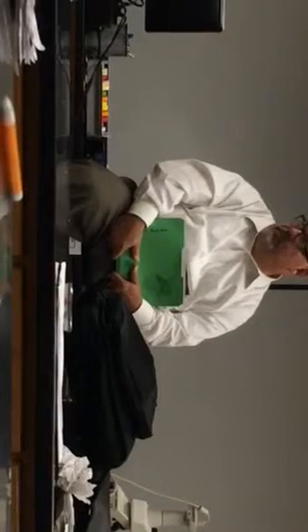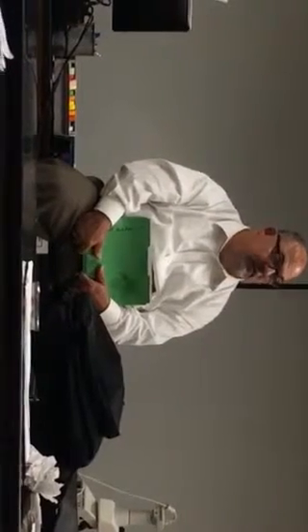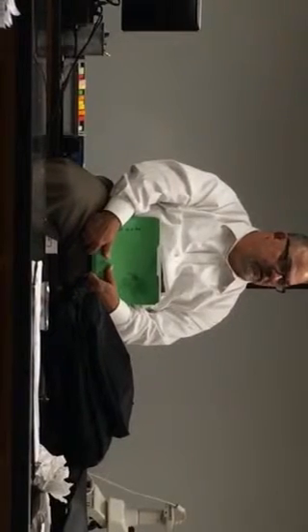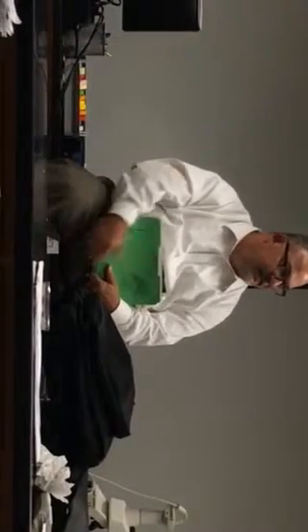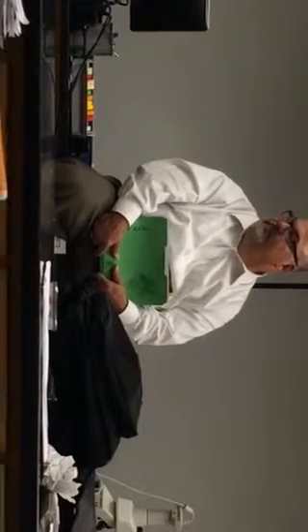I'll go look at the microscope and see what he has on it, just so I'll know whether I want to change it and tell you there's not a microscope or there'll be more than that. I know he's got a lot of arteries and veins, because he likes those. He did marginal and phrenic, and he did azygos, and I didn't have you know those, so I have to change them on the practical. It'll probably be the same question, I'll just move the piece of tape.